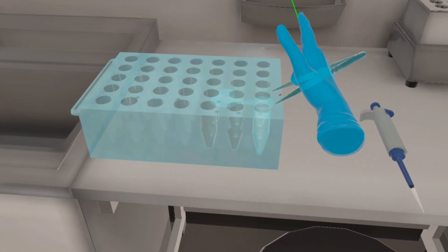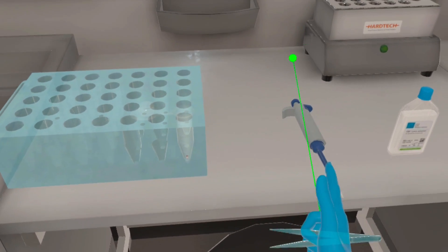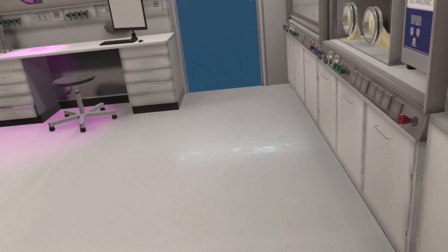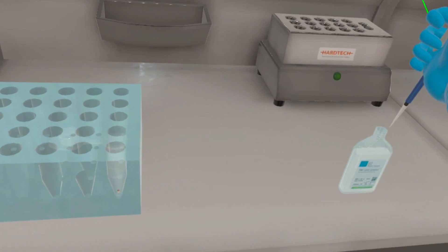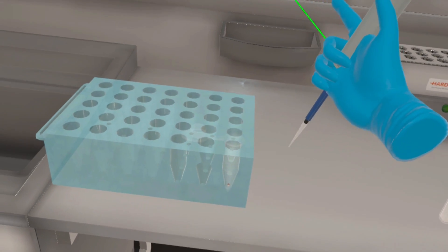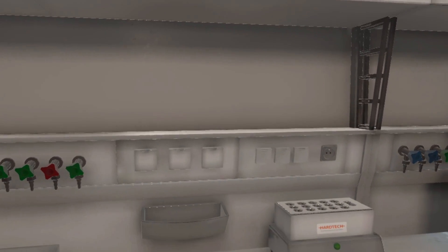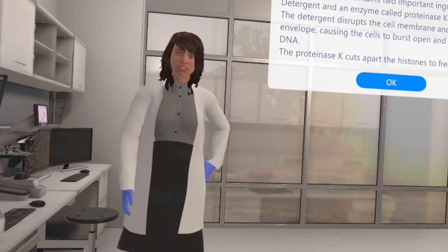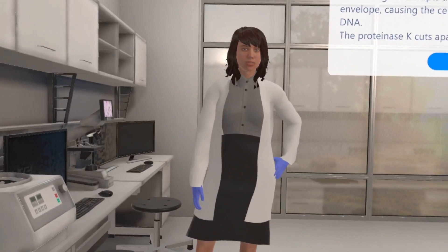Put them in the highlighted microtube or Eppendorf placed on a stand. Now grab the highlighted micropipette and collide it with the highlighted bottle to fill in the lysis solution. The lysis solution contains two important ingredients: detergent and an enzyme called proteinase K. The detergent disrupts the cell membrane and nuclear envelope, causing the cells to burst open and release their DNA. The proteinase K cuts apart the histones to free the DNA.